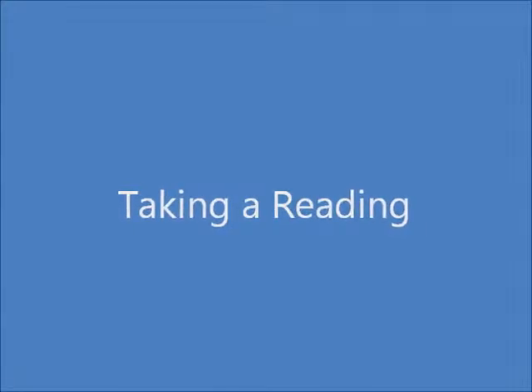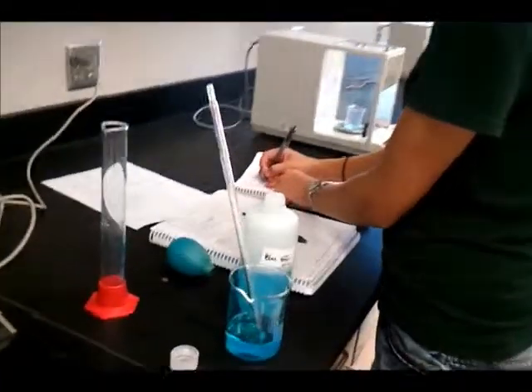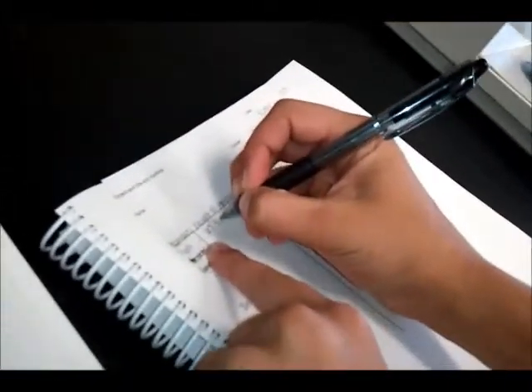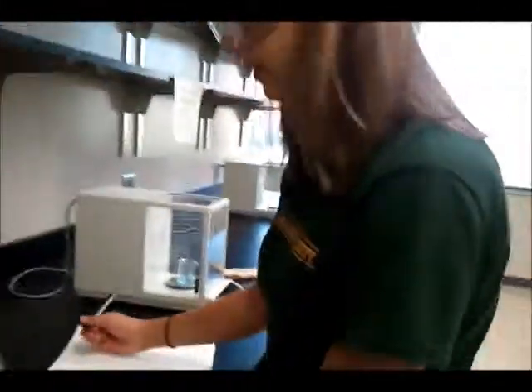After the object is on the pan, wait until the numbers on the screen stop changing. The number that it settles out to will be the mass. The balance can measure out to four decimal places.